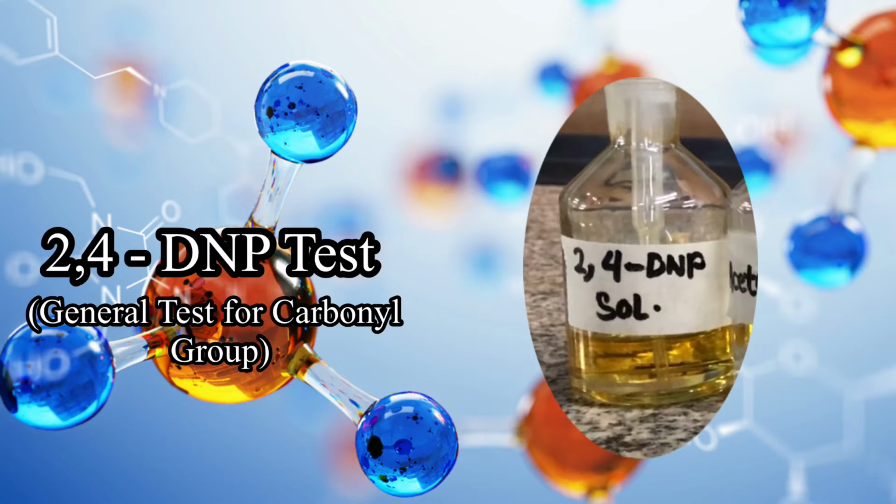The first test is the 2,4-DNP test, also known as the 2,4-dinitrophenylhydrazine test. This is a general test for the presence of carbonyl group, which means to say both aldehydes and ketones will give a positive result. The positive result is the yellow precipitate, which is the dinitrophenylhydrazone product produced by the reaction between the 2,4-DNP and the carbonyl compound.